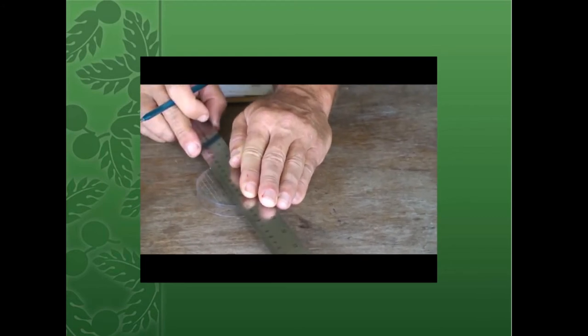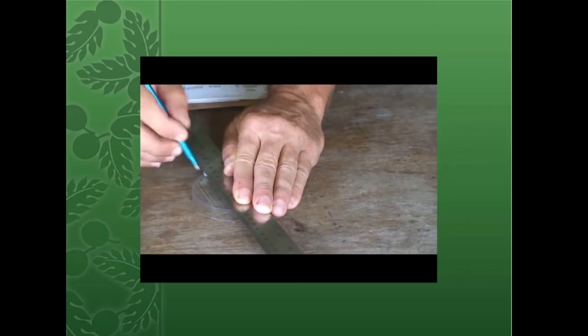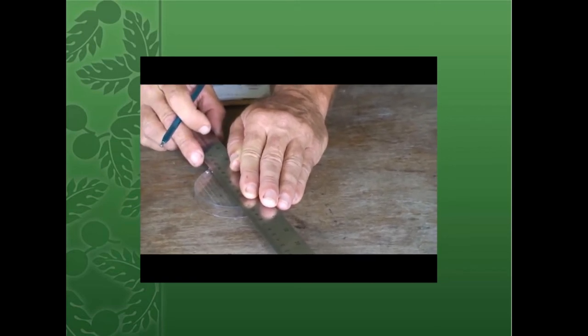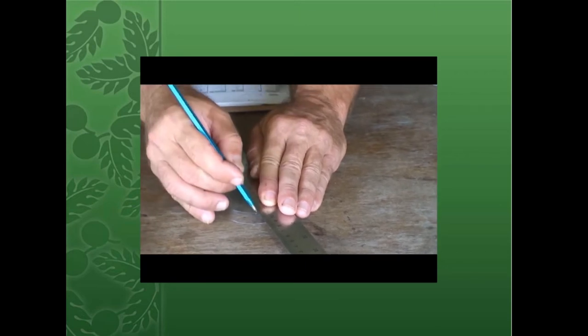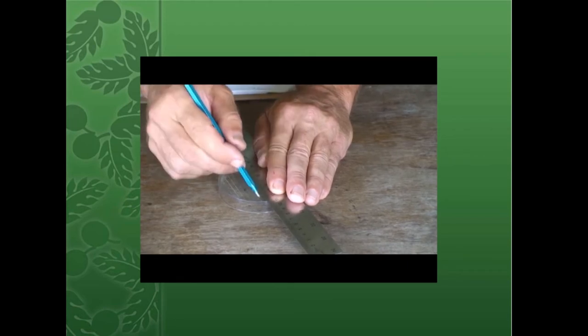So this is a diamond pen. You could take the point of a pair of scissors. You could probably take a razor blade down through here. It's very easy to scratch this. So you're just making a way so you can keep track of the eggs that you've counted.